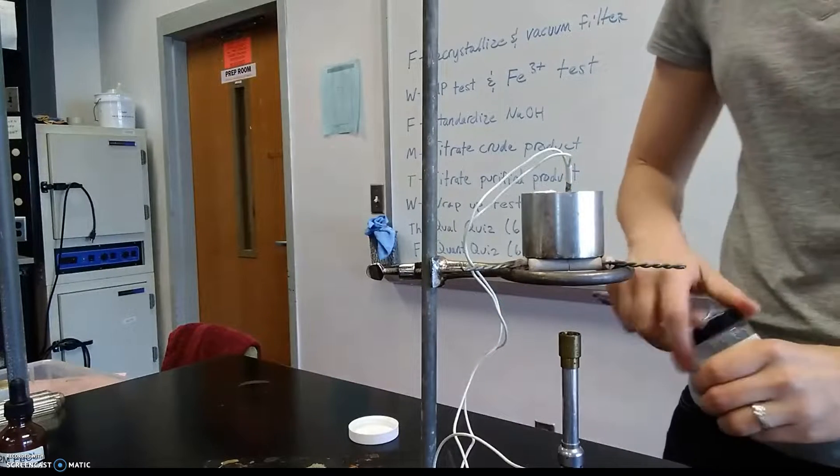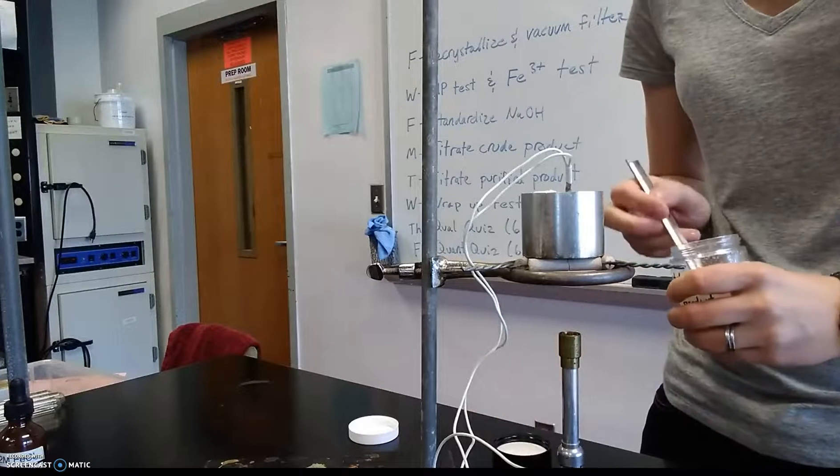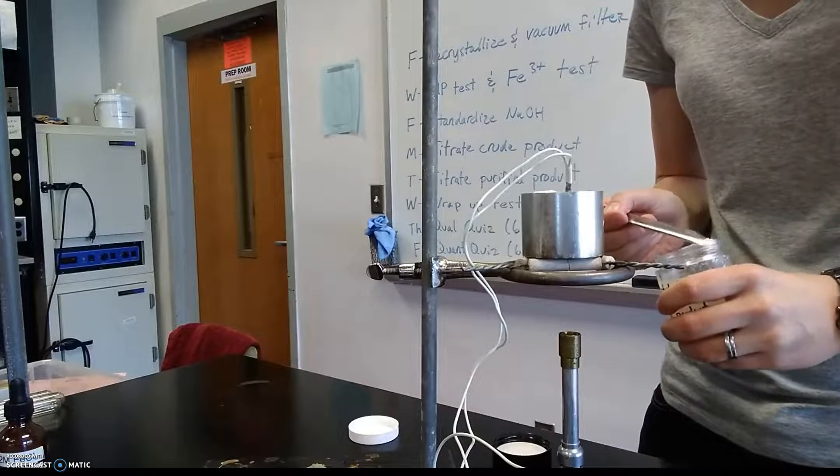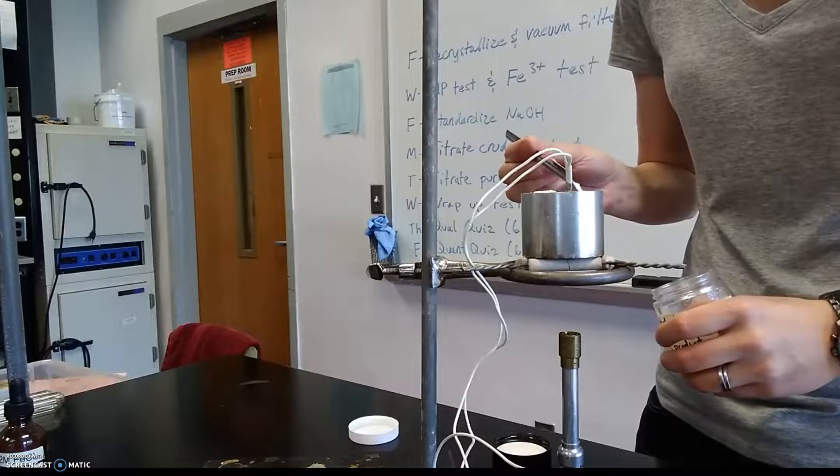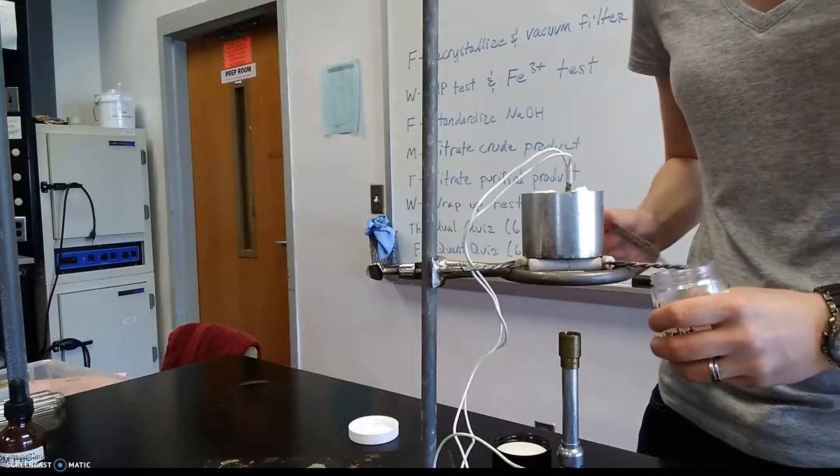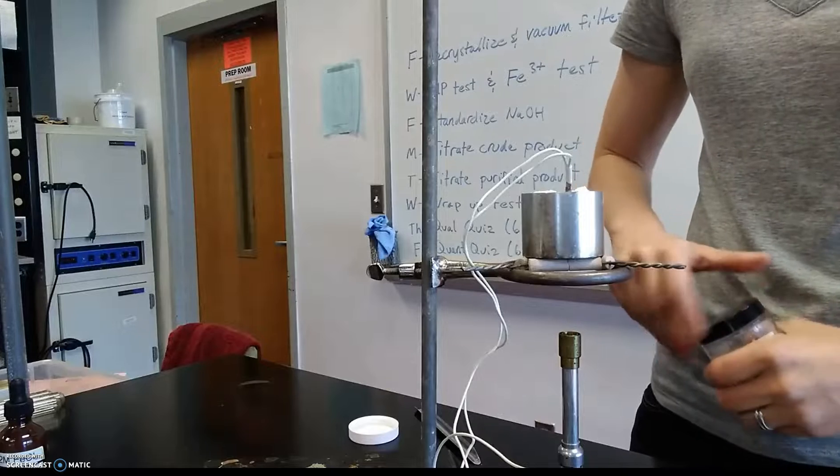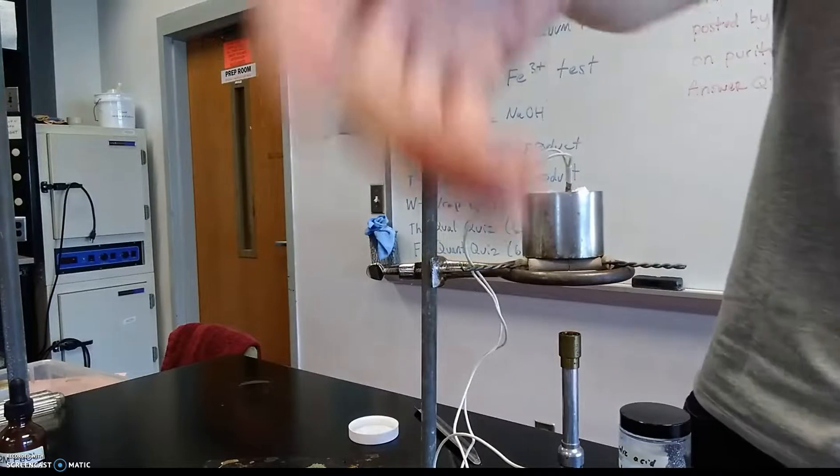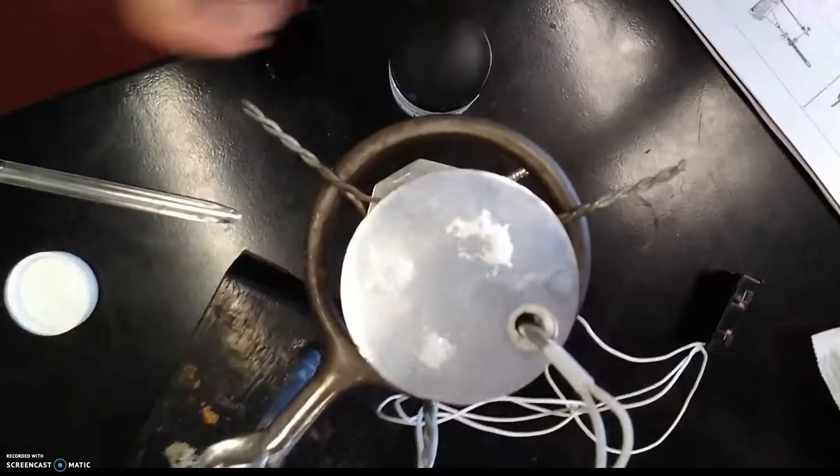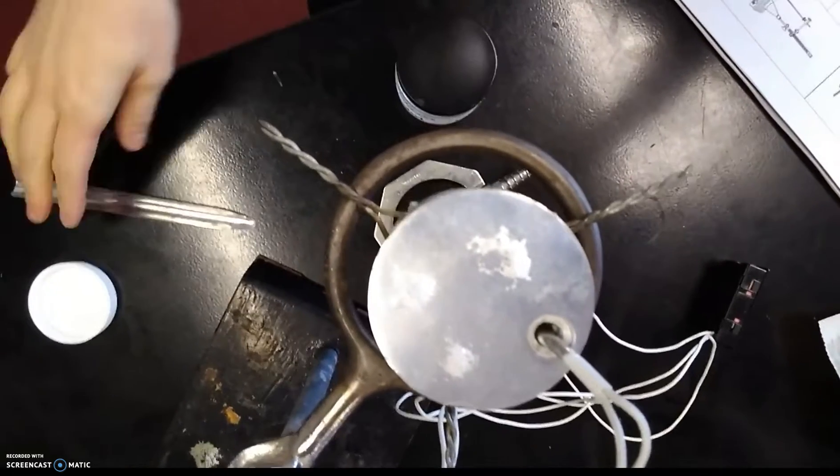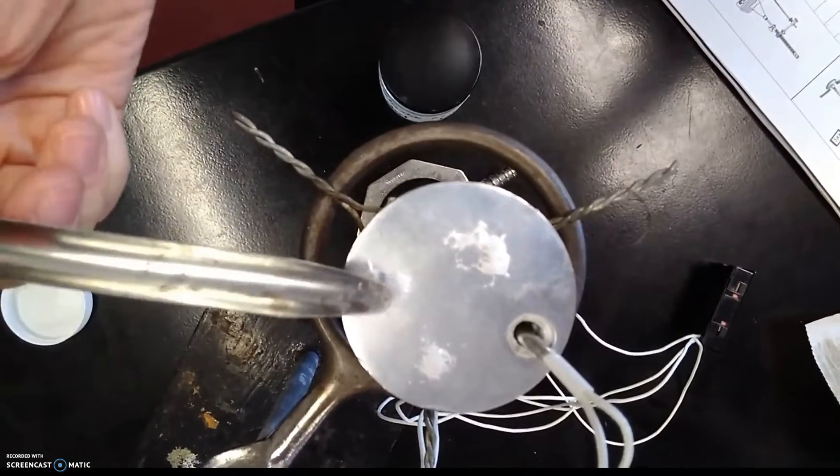And then put the crude aspirin product up there as well. Now you probably notice these are all white solids, so telling them apart is going to be difficult. You might want to draw a little diagram in your notebook like a circle and then label what is what in relation to the thermometer hole. Let's see if I can do this. Really good camera work here. So this is what it looks like on top of the melting point apparatus, the big aluminum cylinder.